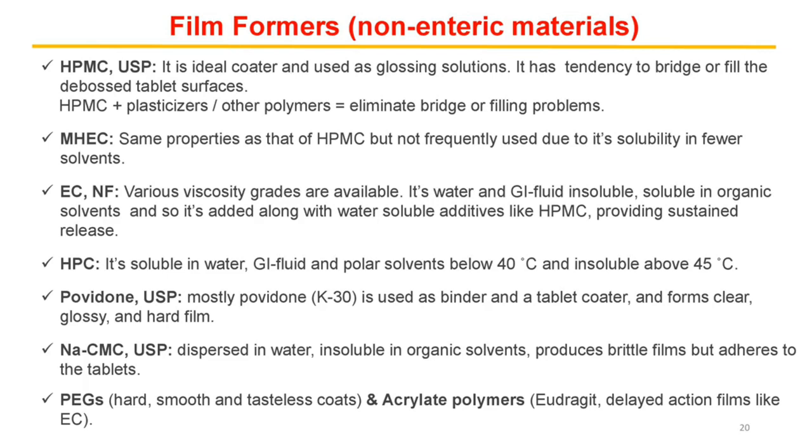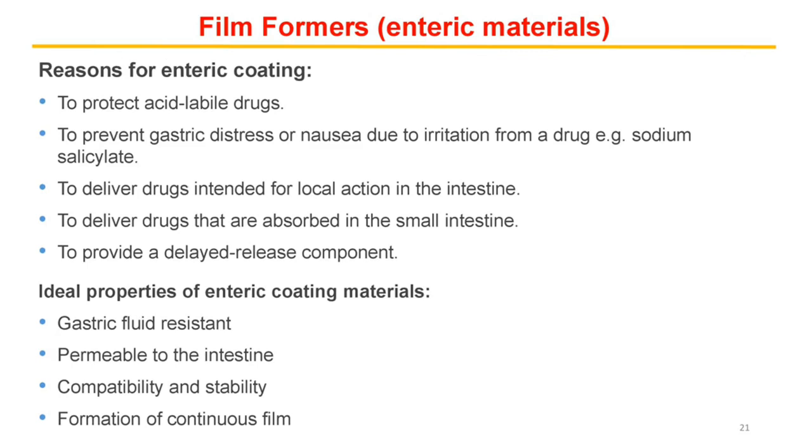NaCMC, USP, dispersed in water, insoluble in organic solvents, produces brittle films but adheres to the tablets. PEGs give hard, smooth and tasteless coats, and acrylate polymers, Eudragit, give delayed action films like EC.